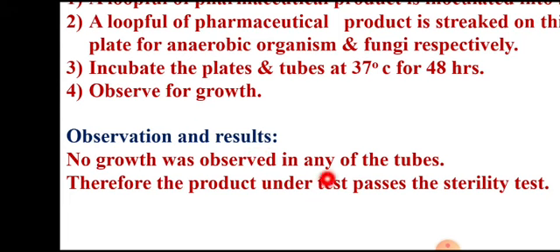So you can write absence of growth in all the tubes, and therefore our conclusion will be the product under the test passes the sterility test. So this is how we write the conclusion, observation and results.